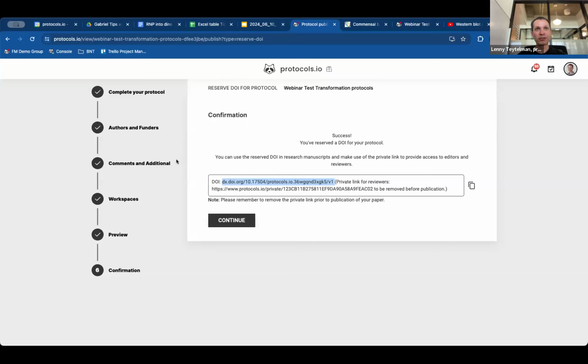Both are very similar workflows, but reserved DOI is for the instances where you're submitting a paper but are not ready until the review is done. You don't feel comfortable for whatever reason making it fully public. So I think we've answered that.